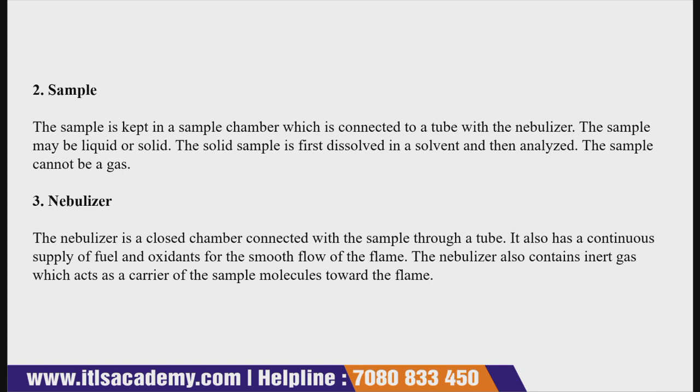Now comes the nebulizer. The nebulizer is a closed chamber connected with the sample through a tube. It has a continuous supply of fuel and oxidant for the smooth flow of the flame. The nebulizer also contains inert gases, which act as a carrier of the sample molecules towards the flame.